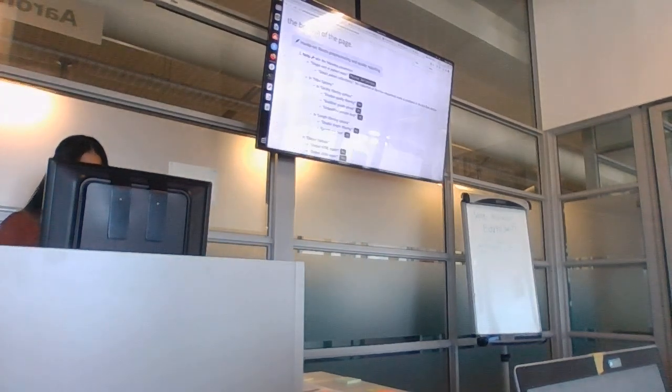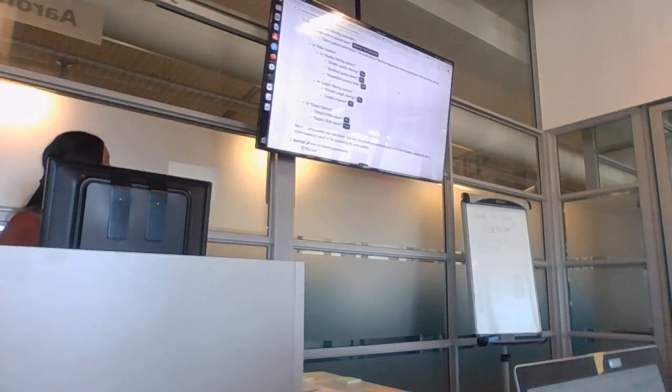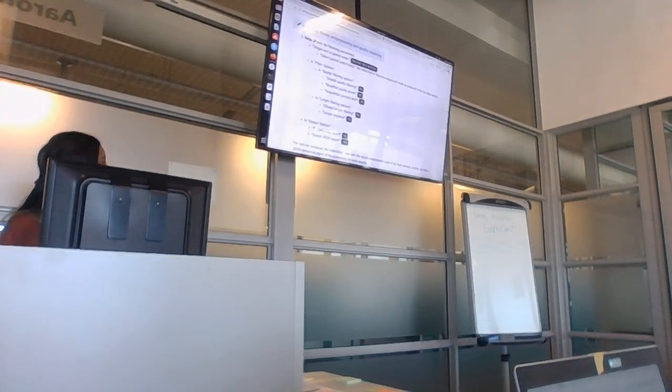If you can't see it on my screen, it should be on yours. You can see we want the phred quality 20. I think this is already filled in.